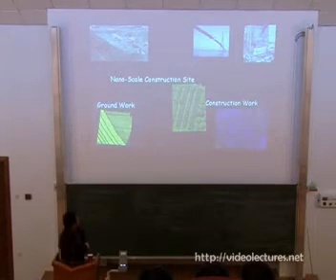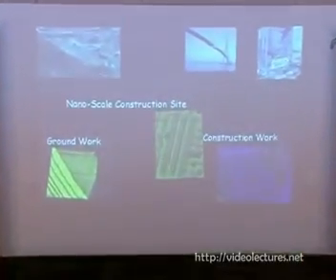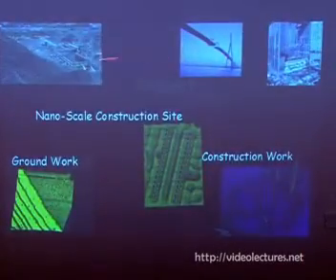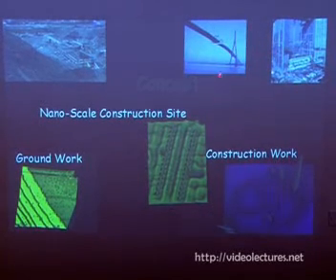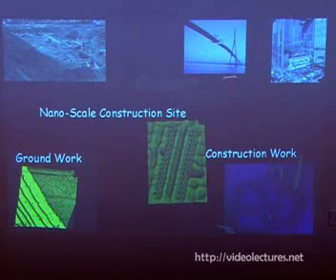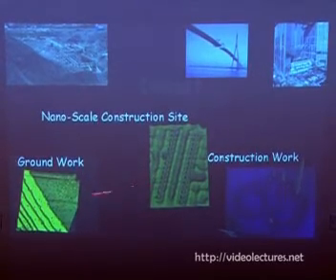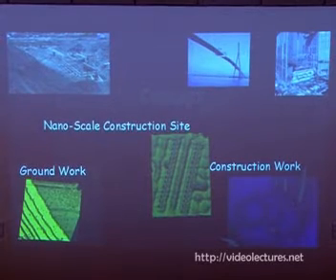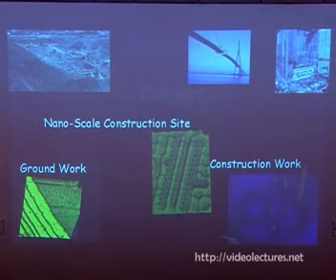So let me start with atom manipulation. This is just the concept of atom manipulation. This is the human scale; I just took it from the internet, from Paris. When we build structures, buildings and bridges, at our scale, we take materials from the earth and build the structures. Similarly, we can build structures by taking individual atoms out of the surface, and we can build various different structures.